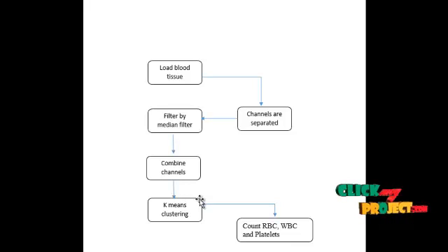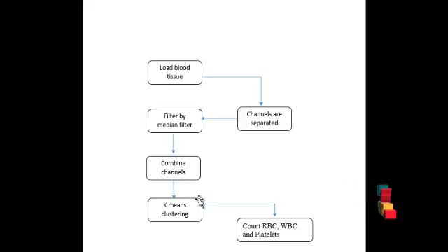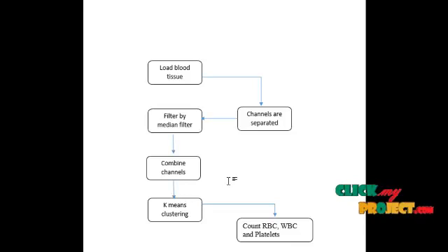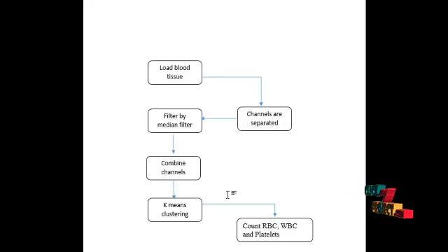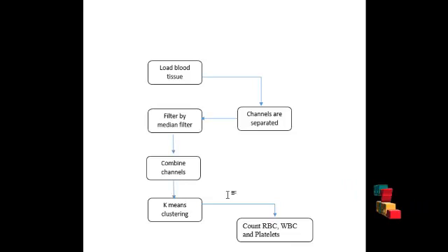The clustering values are differentiated by separate colors, where each color denotes the same type of segmentation. That segmentation is based on the size of the blood cells. The segmented blood cells are connected by boundaries, and the boundaries are labeled by numbers. The labeled numbers are separated, and then we count the labeled count, which is displayed.